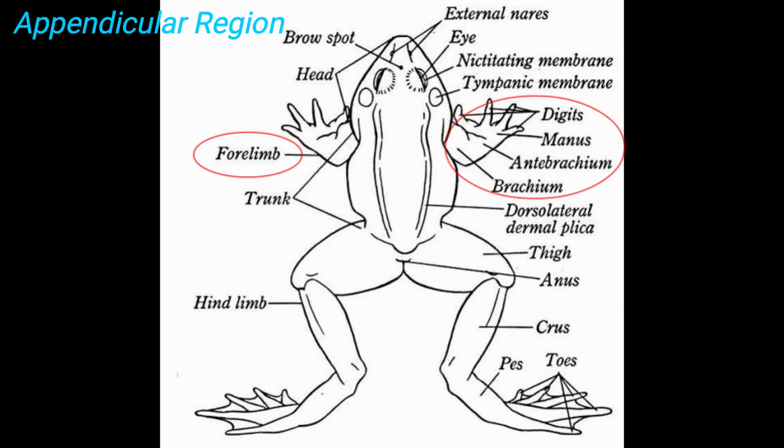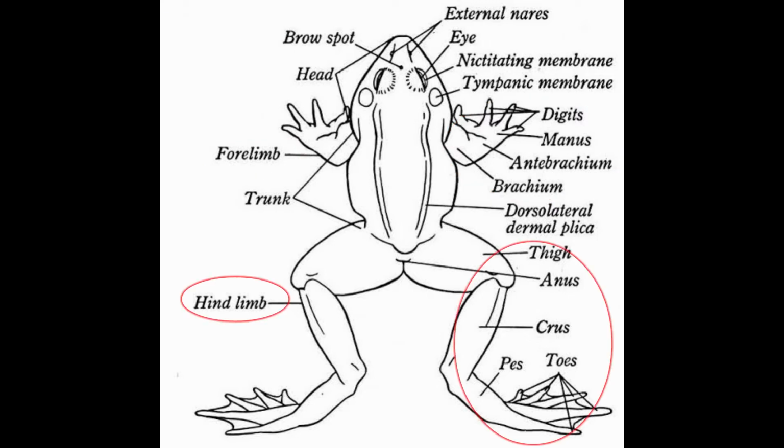the upper arm, the middle forearm, the carpus or wrist, manus or hand, fingers also called digits, and also the prepollex which is the rudimentary first finger. As for the hind limbs, it features the thigh, the shank, the tarsus or the ankle, pes or foot, the toes also called the digits, the web, and the prehallux, which is a small sixth toe, which also may be missing.